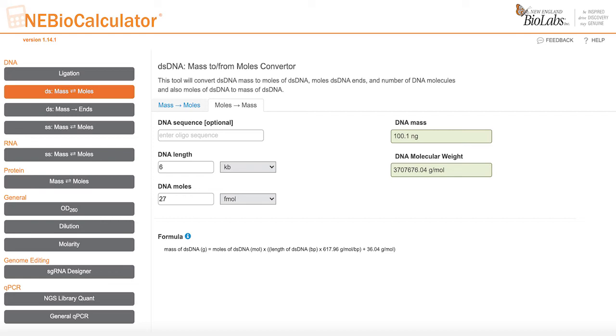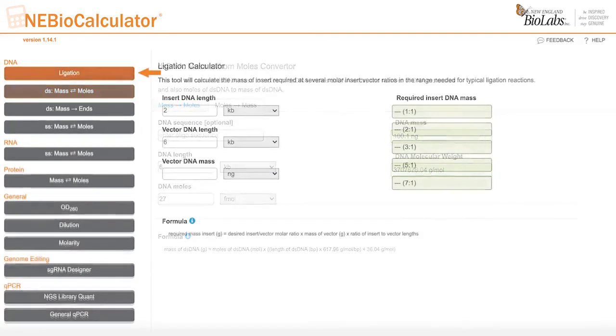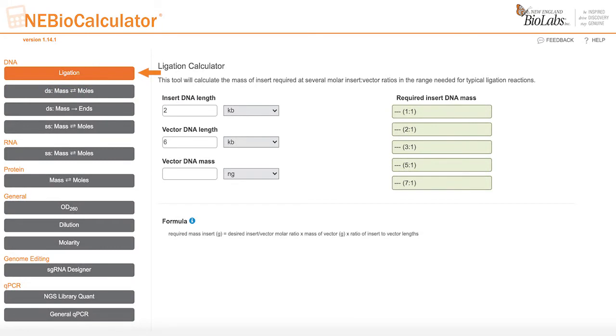Then, go back to the ligation module by clicking on the ligation box on the left. Make sure the values of insert at 2 KB and vector length at 6 KB are present. You can then input the mass of vector DNA of 100.1 nanograms, which again is equivalent to 27 femtomoles, into your reaction.